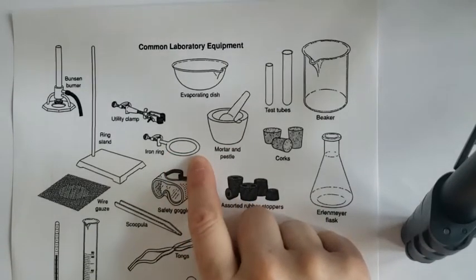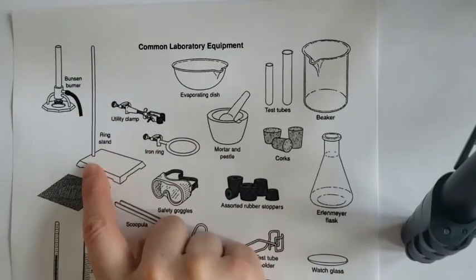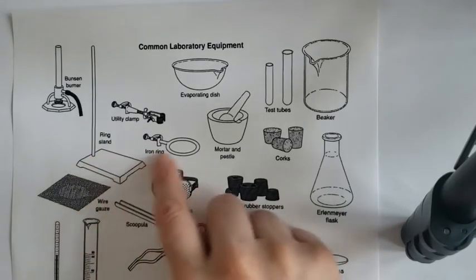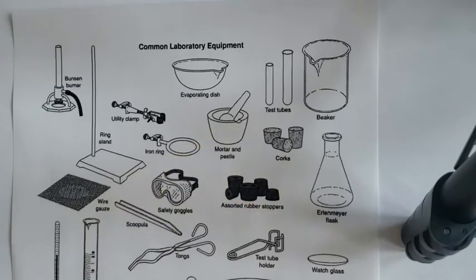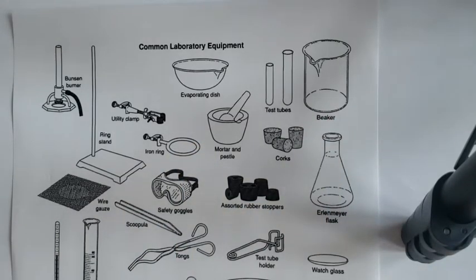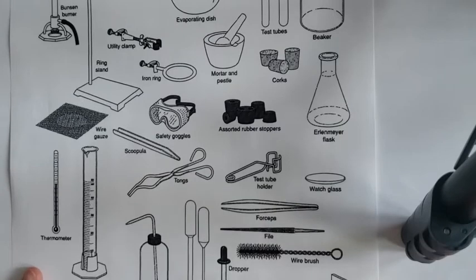The iron ring, now this is interesting. So the iron ring we put on the ring stand, and we're lucky in our classroom, these just screw right into the desk. You don't have the base. But anyway, so you screw this on, you put one of these wire gauzes on top, and then you could set one of these beakers on top of that. And again, in case you can't find the names of some of these pictures, I'm just going over the names for you. You can watch the video and hopefully catch it.